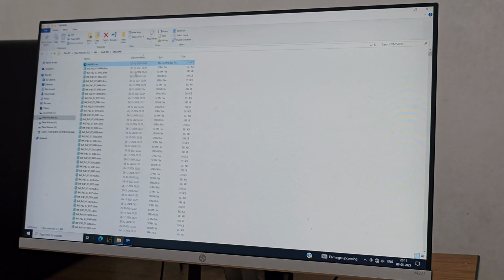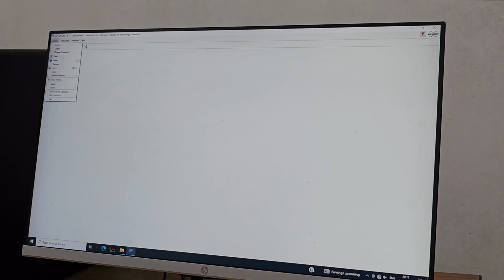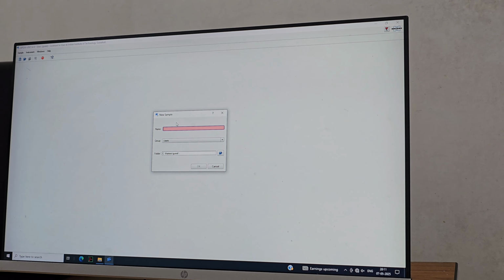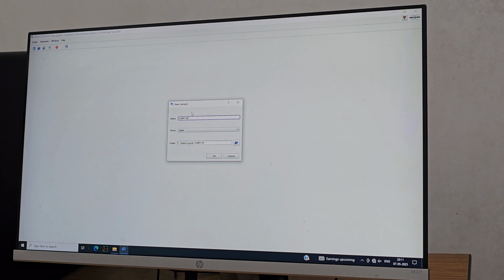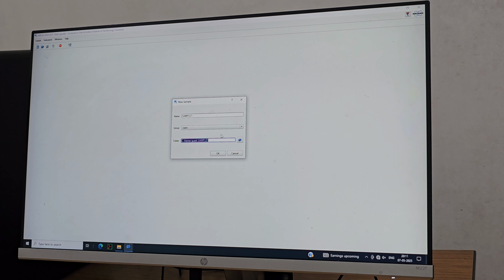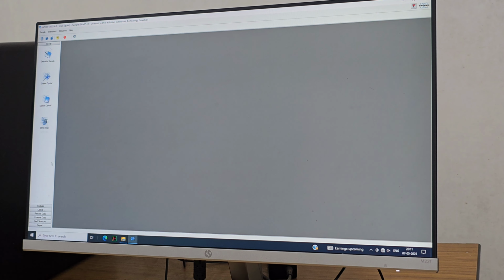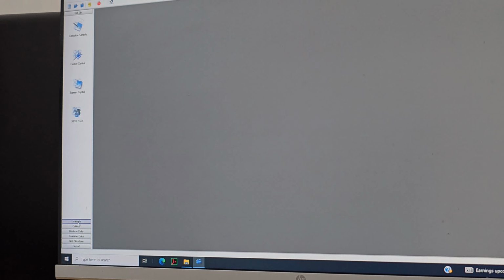Now we go to our sample folder where the data is stored. Then press New. Write your sample name here, suppose Sample 1, like that. Now we paste the directory link, then press OK. Now here you see some icons. Among those icons, you press Evaluate.